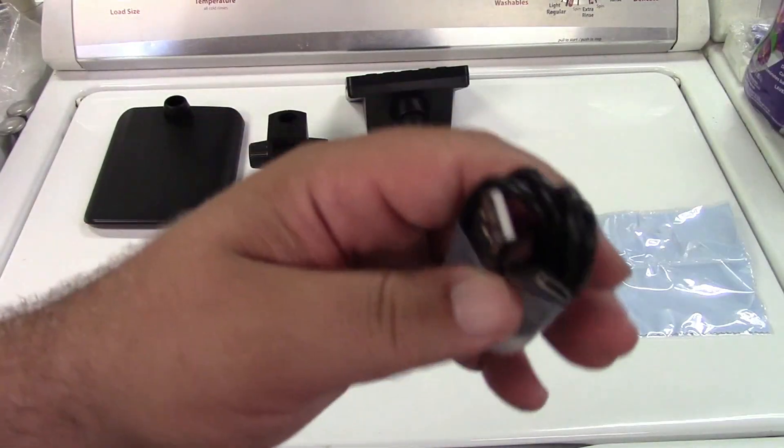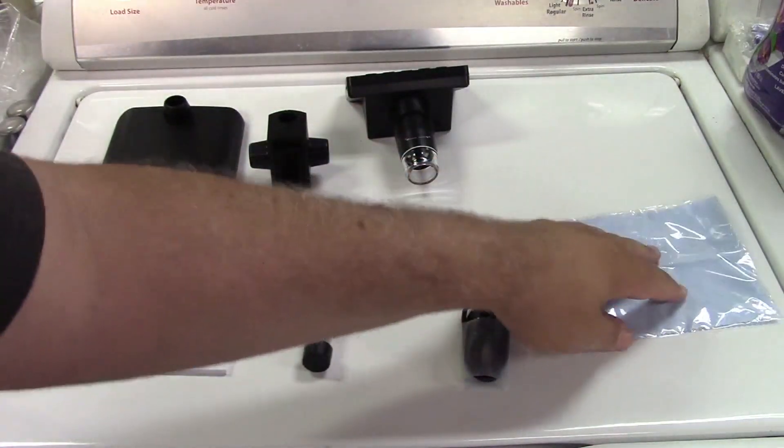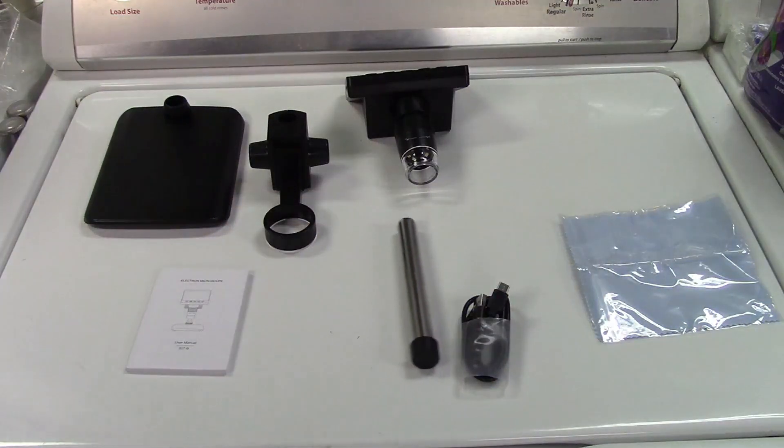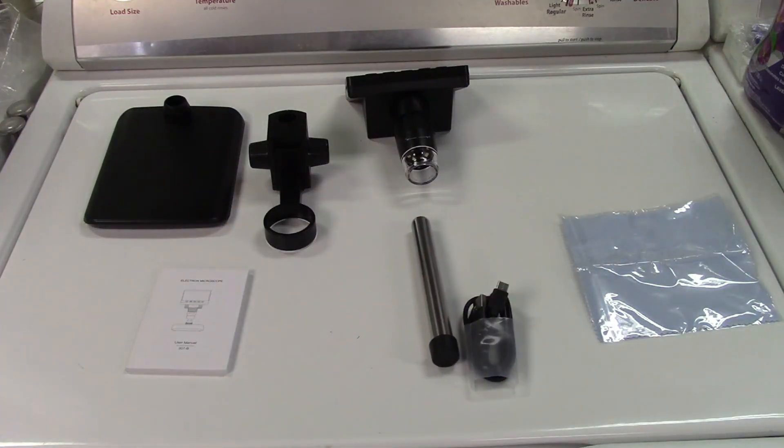Charging and data cable, USB to USB-C, over here is a little lens cleaning cloth just like that. Let me tell you a little bit about this first. I'll show you how it goes together and then we'll test it out.